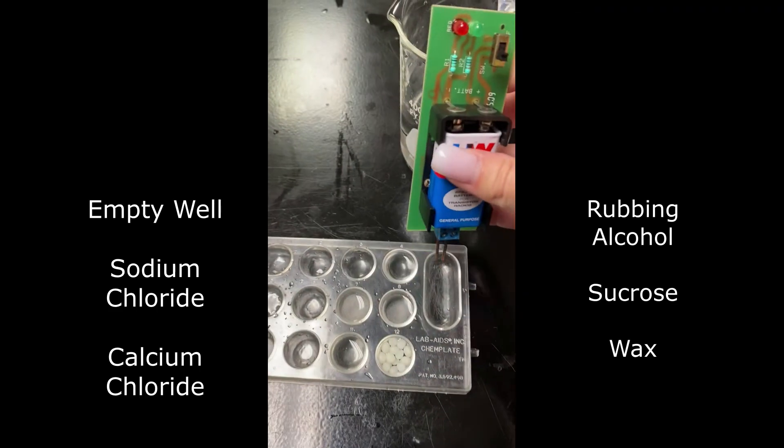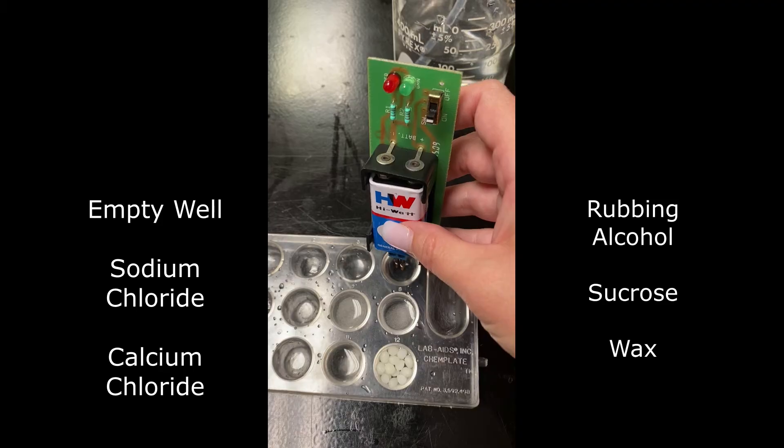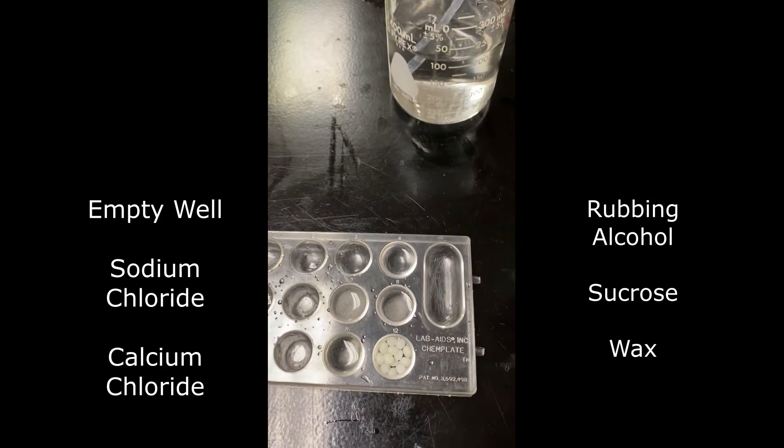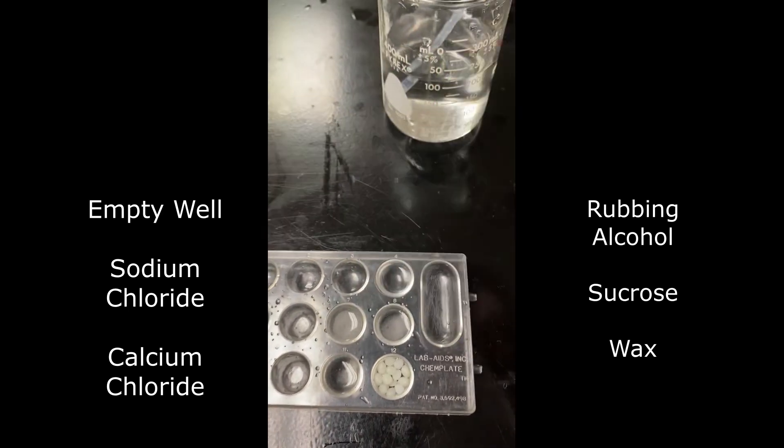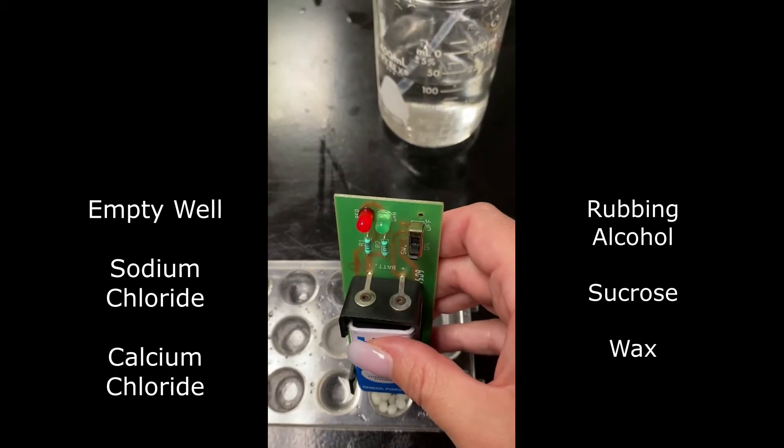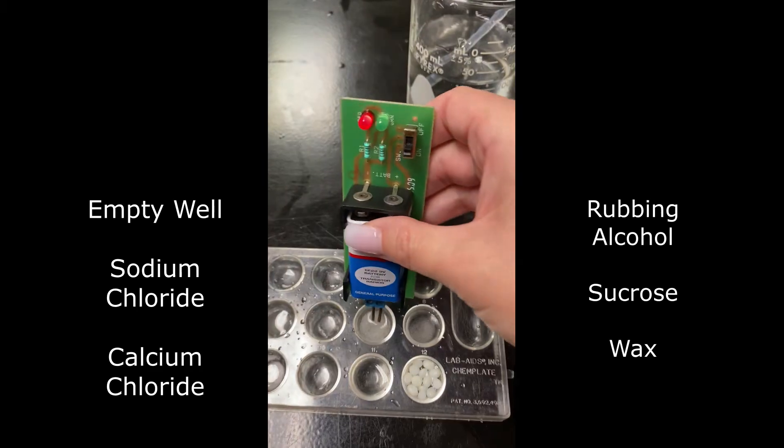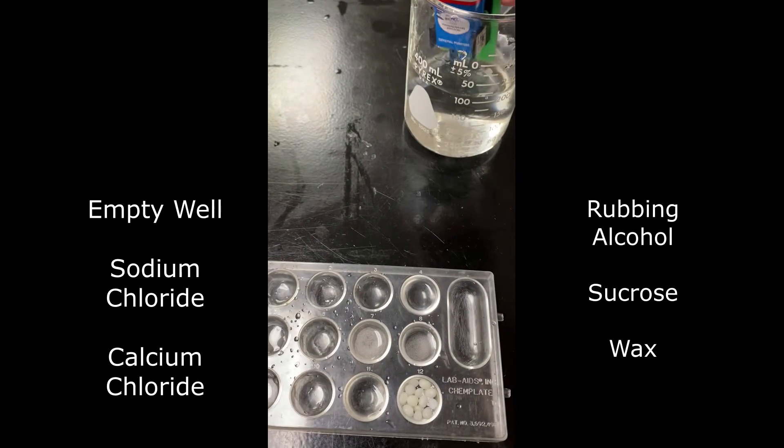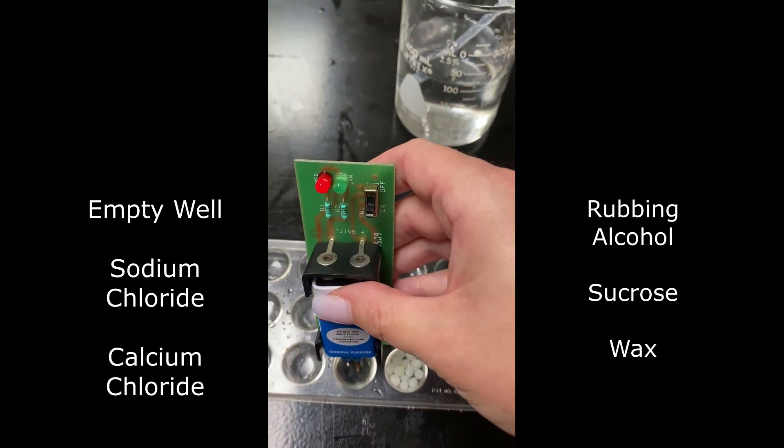We went ahead, turned on our conductivity meter. We're going to put it in our rubbing alcohol, which is just isopropyl alcohol. Make sure you always clean off your probe before you put it in the next chemical. And here's our sucrose. It did light up. That's most likely just from our tap water. Same thing with the wax and the water. It's most likely just from the tap water. And then our sodium chloride is very bright. And then our calcium chloride is the last. And again, it is very bright.